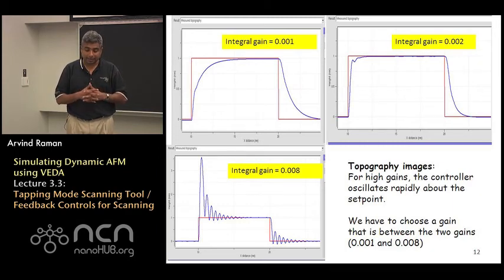So if one wants to improve the measured topography one might be tempted to increase the integral gain. And if the integral gain is increased to .002 you do find indeed that as soon as you hit the feature the amplitude responds very fast.